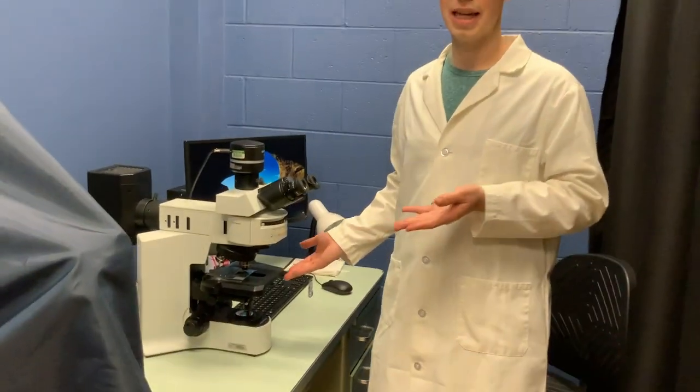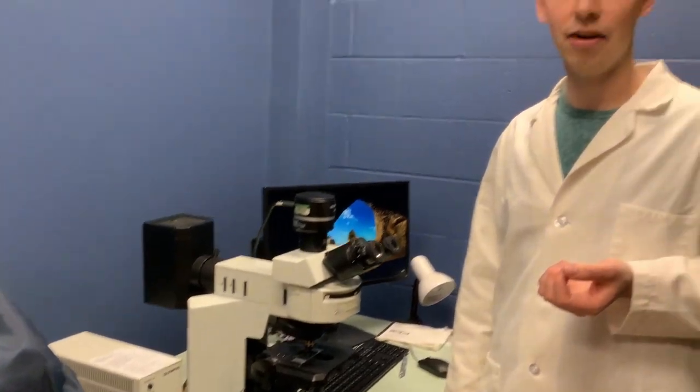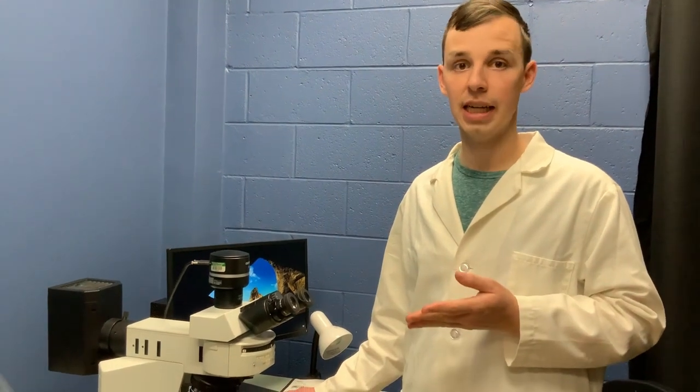On this microscope, though, you can get true color. So if you're doing crystal violet staining, or DAB immunohistochemistry, this is the microscope you have to use — or H&E — to actually get color, not just black and white.